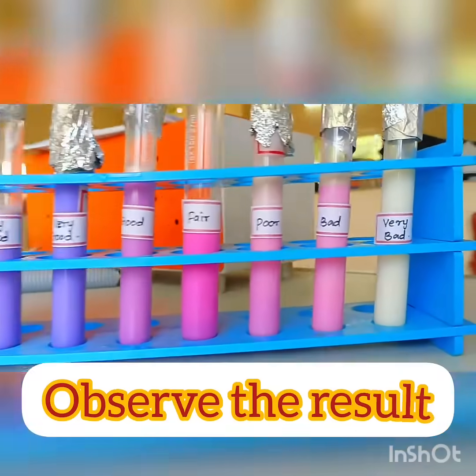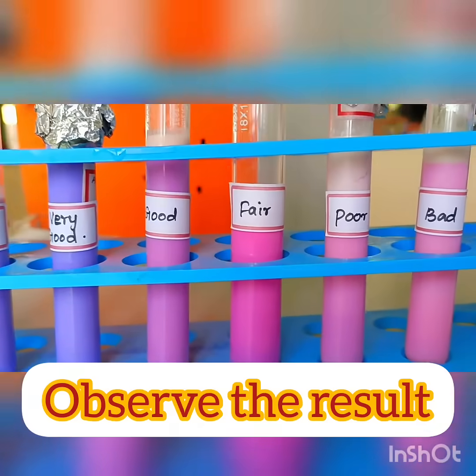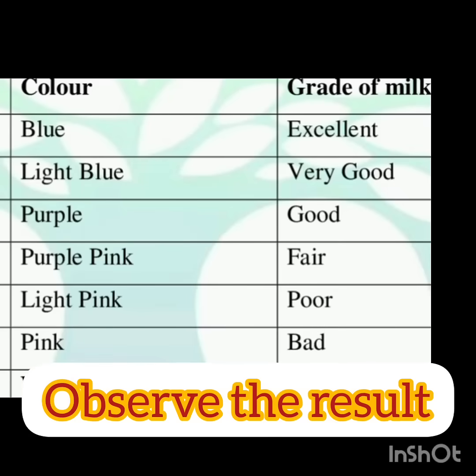After that, remove all the tubes from the water bath and observe the different colors to read the results. The color of the milk indicates the grade of the milk.